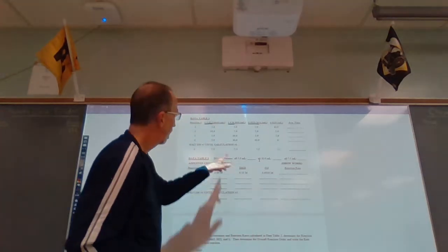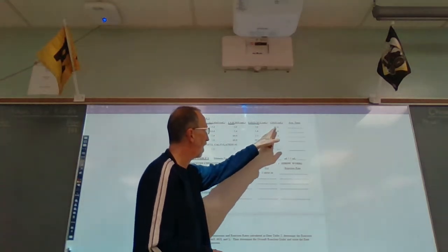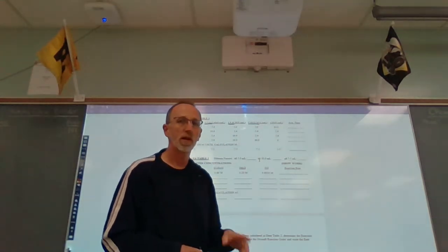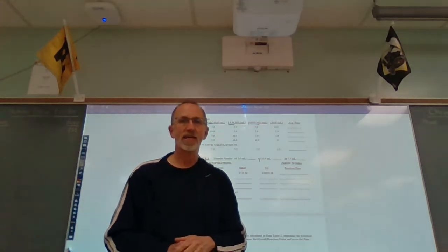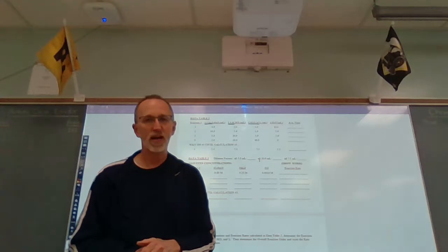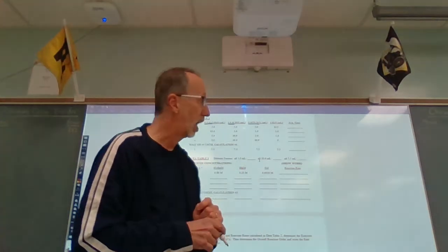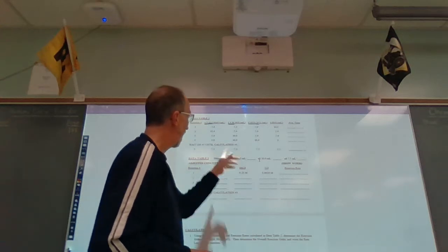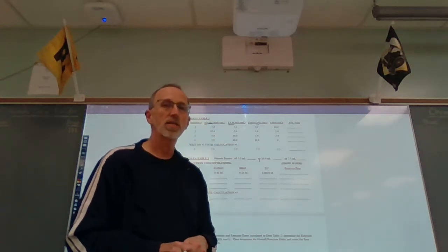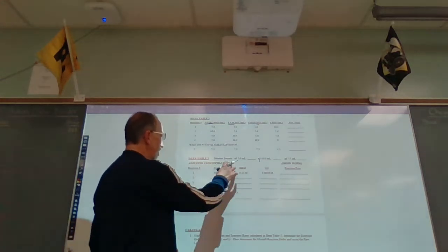So think about that. Here's 5 mLs of acetone, it's all acetone, but now we've got 25 mLs volume total, but still of that 25 mLs, only 5 mLs of it is acetone. And when you take 25 divided by 5, you get 5. When we add the rest of our ingredients here, we have diluted the volume of acetone from 5 mLs to 25 mLs. So this is where the adjusted concentration comes in.